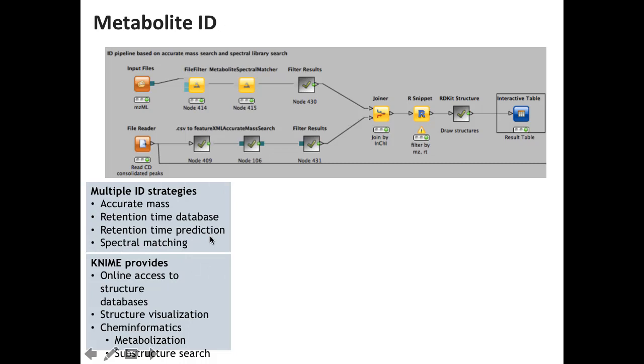You can also do spectral matching. If you have tandem spectra that are associated to a particular feature, you go into a database with that, or you have your local database. Many of our collaborators also have spectra that they have measured, that they have manually identified. They usually have a couple hundred or 1,000 spectra, and they're sitting there, and we just match them and say, yeah, this looks like glucose.